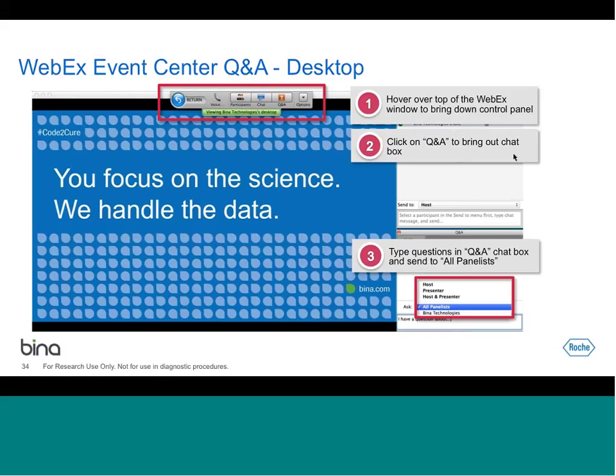So in our Bina array, we have a very good version control system, so you can always run the exact same pipeline for your training data and your test data. That is a very good point, that the workflow has to remain more or less identical between the training and the test.